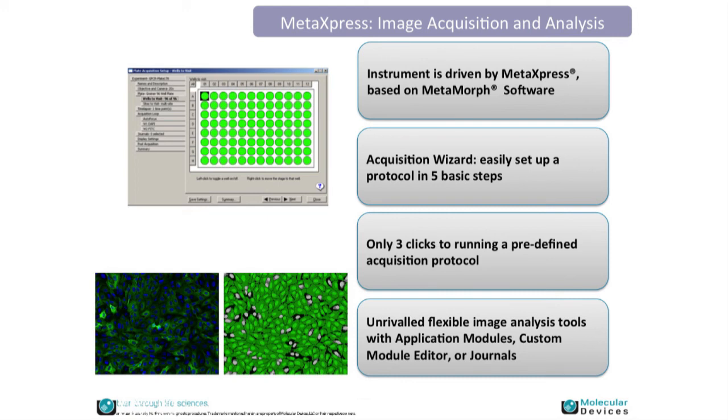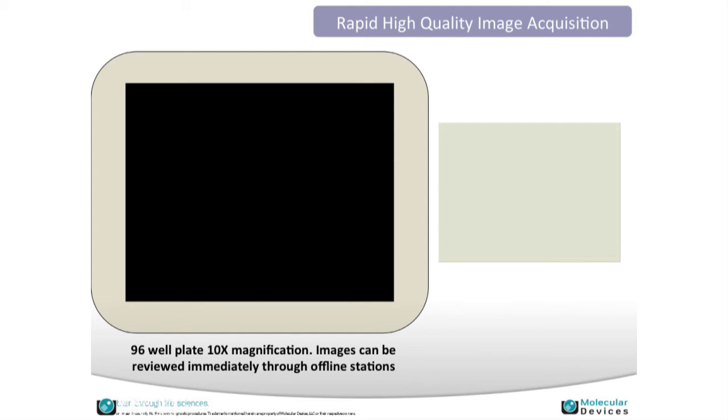A bit about the software. MetaExpress is based on Metamorph, which serves as the backbone. MetaExpress adds plate utilities as well as integration with a database for larger data sets. Setting up an experiment takes just a few clicks, and you can save these setups for use as a starting point later. This example shows acquiring a 96-well plate containing zebrafish, showing how the system looks on the software while acquiring images — building essentially a virtual plate.